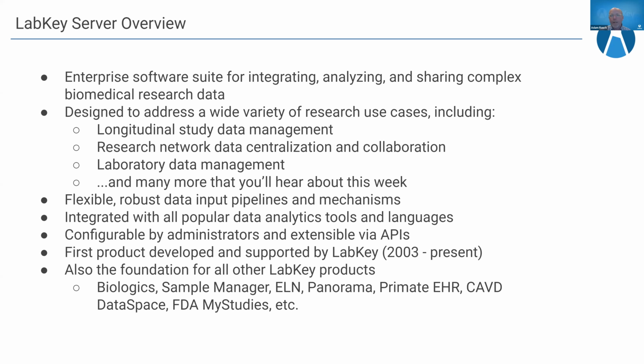There are many key services that LabKey Server provides, but I always like to emphasize the flexibility and robust data pipelines for getting data into the system. If you have a system like LabKey that integrates with other systems in a laboratory or in a scientific institution, other databases, a variety of file formats and other systems, you need very robust and configurable pipelines to get that data in, ideally on an automated basis. And that's one of the key things that LabKey Server provides.